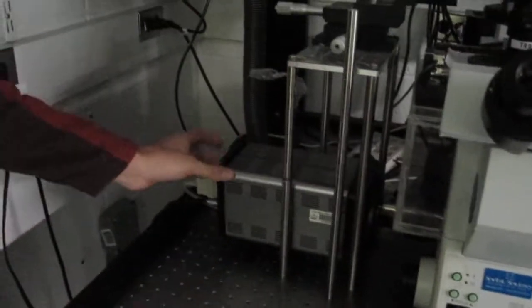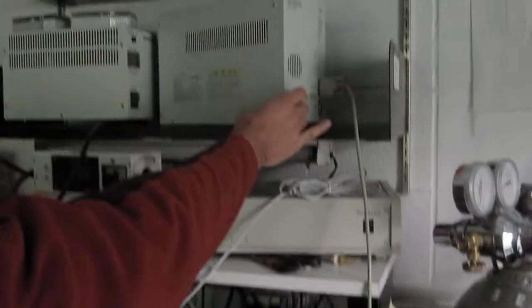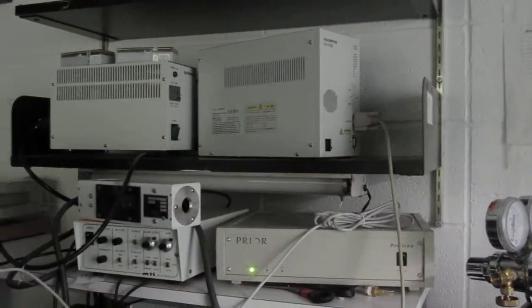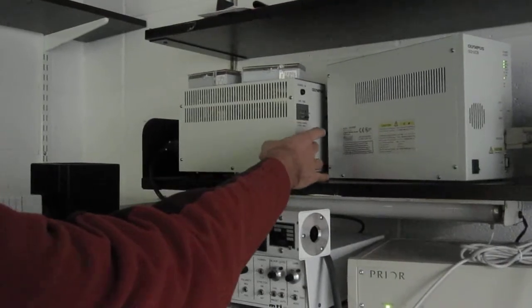Okay, first thing we're going to do is turn everything on. That's the camera, so we turn the camera on. These are the controls of the microscope, there's two of them, we also need to turn them on. And finally, that's the fluorescence lamp. You also need to turn it on.